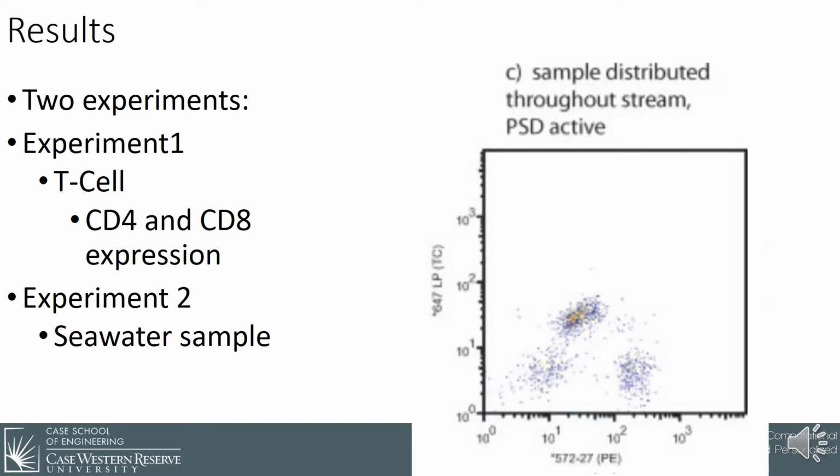Once we add the flow cytometer limitation of only being considered within that focal point region, we see that there are far fewer false signals, and the three clusters once again reemerge. However, it should be noted that the total number of signals has been reduced, as they are not collected, they are simply rejected. However, it should also be noted that the lab was able to demonstrate that this did not result in any false signaling and was within 2% of the standard method.